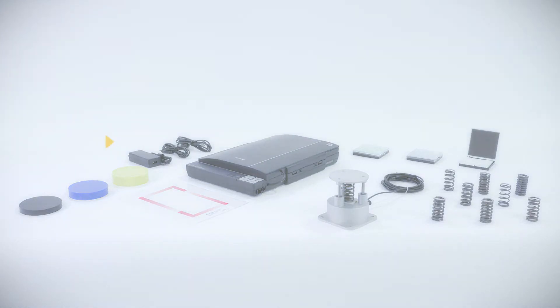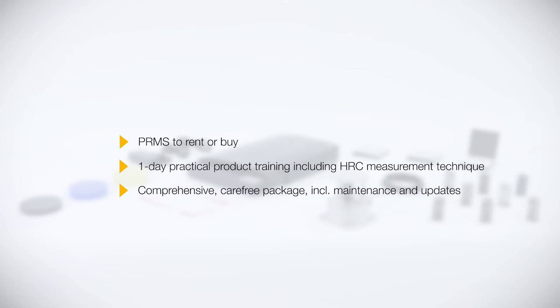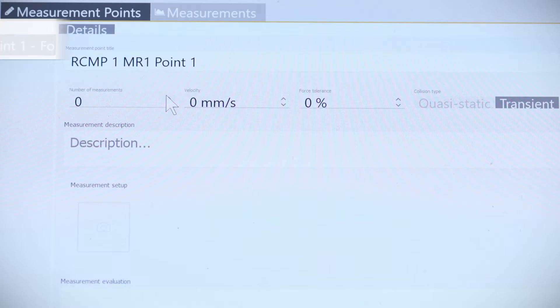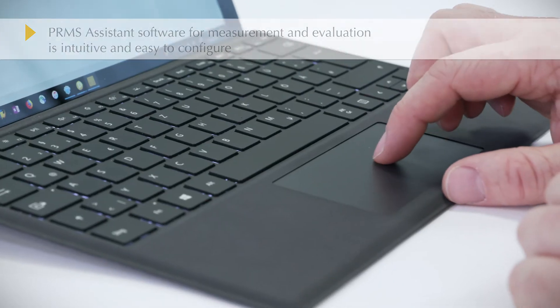You can either buy or rent the Collision Measurement Set PRMS. The set includes one day of practical product training. What you have is a sophisticated, comprehensive carefree package which includes regular maintenance and calibration, as well as the latest software updates. The intuitive software PRMS Assistant is used to measure and evaluate force and pressure and is easy to configure.